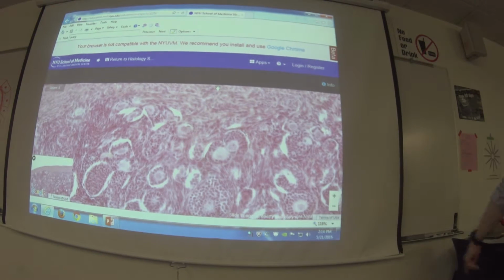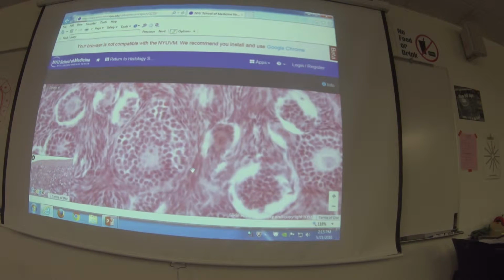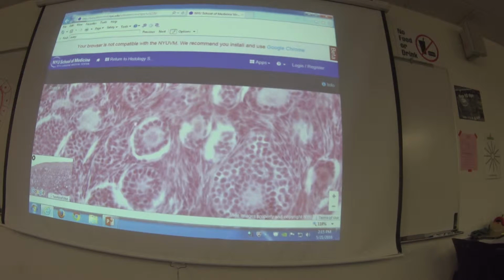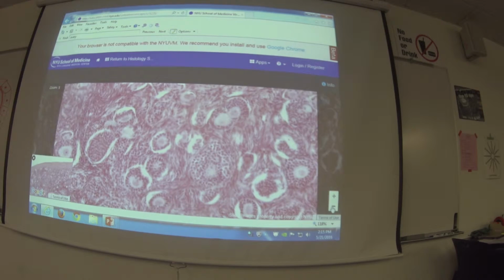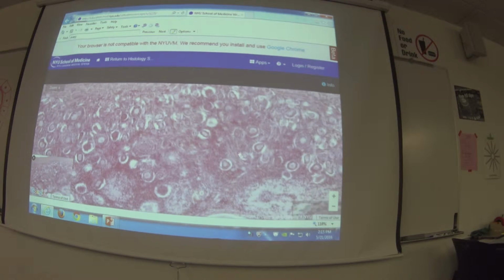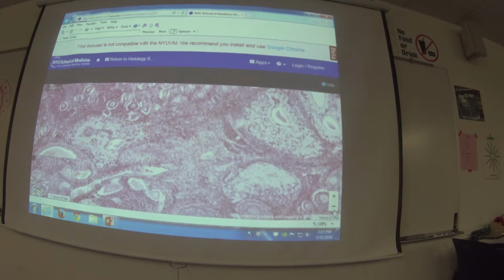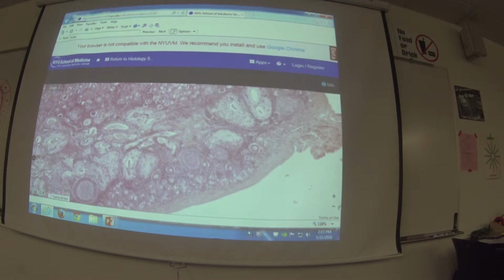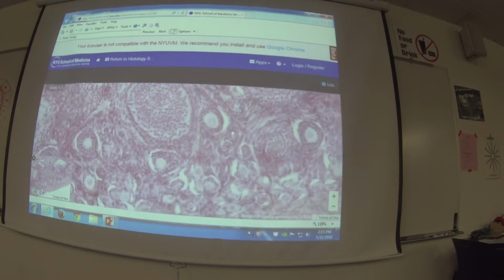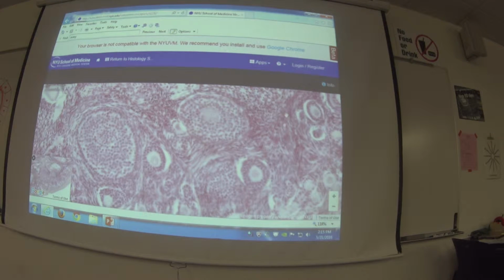Down in the bottom right, there's a nice stratified one. Again, still a primary follicle. Here's one right here too. So these are all primaries. There's a really nice one. Bunch of primary follicles with primary oocytes inside. So if we go deeper, we'll probably run into some different type. And on this side, it gets a little more complicated. These are all still primary.